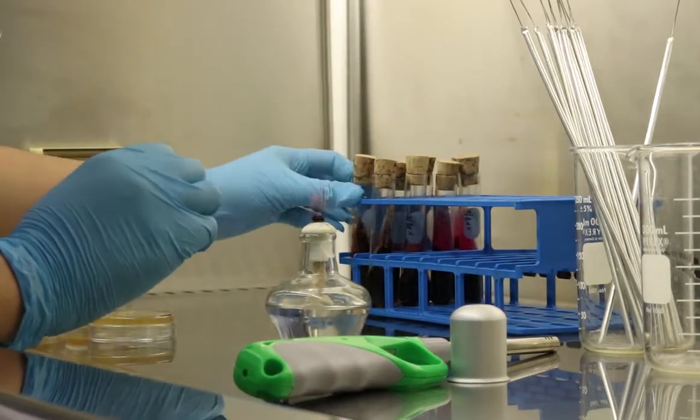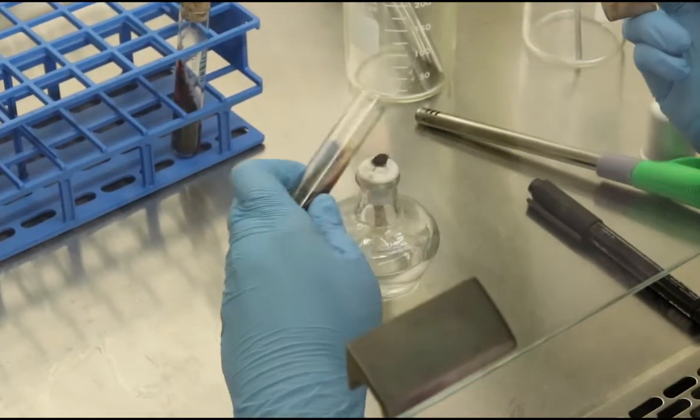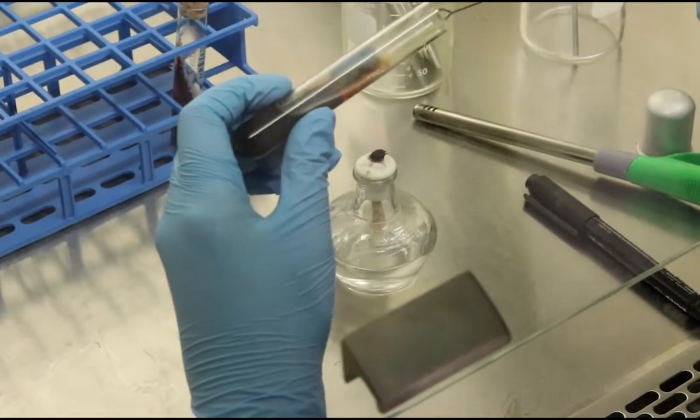Salmonella on the TSI agar was inoculated to the prepared stock culture agar. After this, the plates are incubated at 37 degrees Celsius.